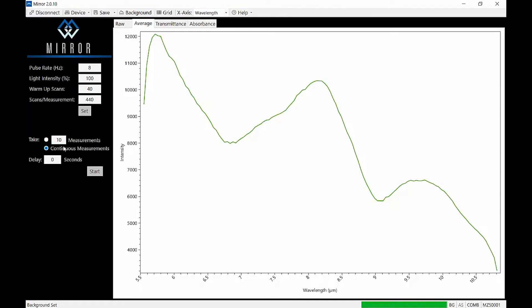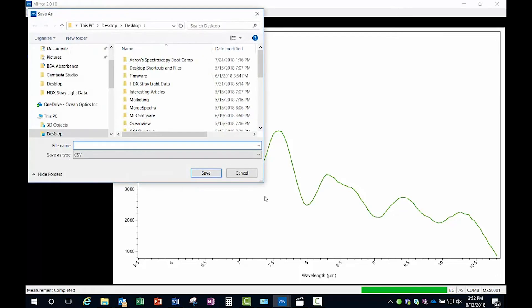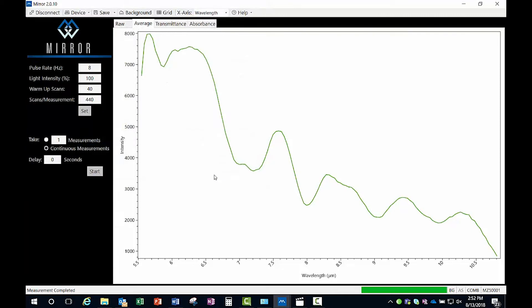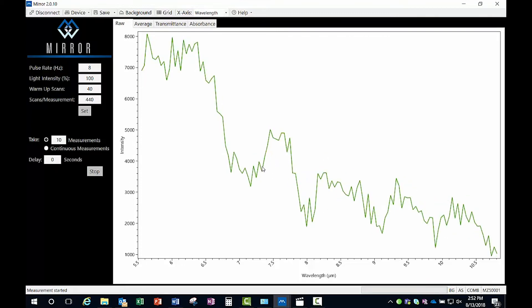You can either specify the number of spectra you want to acquire or choose continuous measurements. Keep in mind that with continuous measurements, the software continues acquiring spectra indefinitely, saving every spectrum along the way. To save your spectral data, click on the Save menu, choose Save As, enter the base file name for your spectrum and choose the save location. The current spectrum will be saved with a time and date stamp in the file name. To auto-save your spectra, go back to the Save menu and toggle the Auto-Save button. All subsequent spectra will be saved automatically with your base file name and a new time and date stamp for each file.